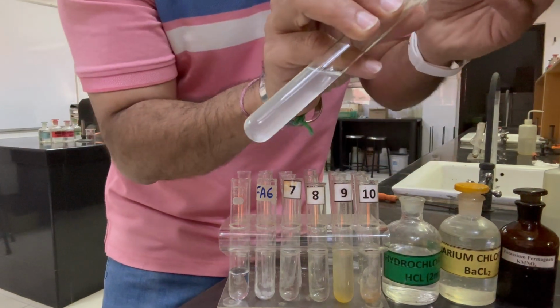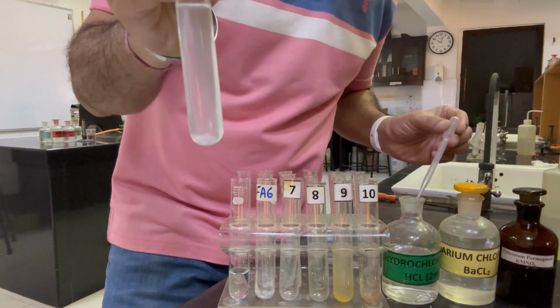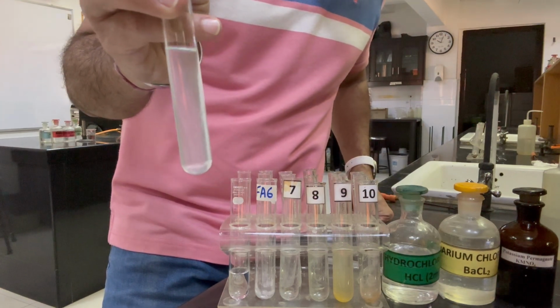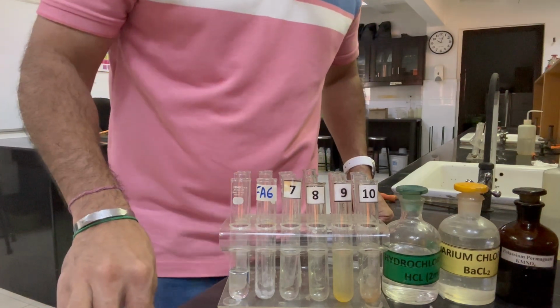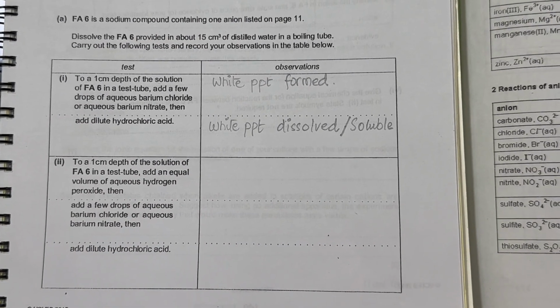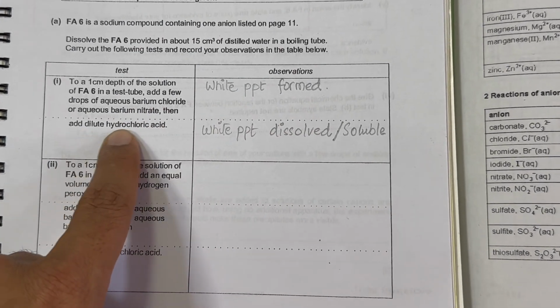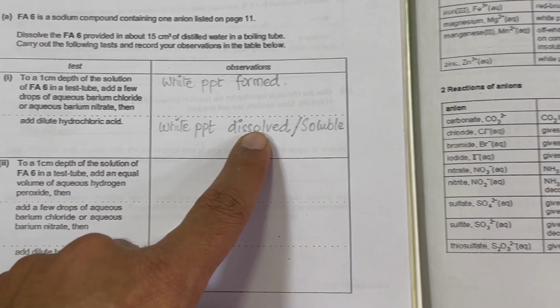It means when barium chloride is added, precipitates are formed. It means sulfate or sulfite is present, and if we add acid and those precipitates dissolve, it means sulfite is confirmed. So we will record this observation. When we have added barium chloride, white precipitates formed, and when we added hydrochloric acid, the white precipitate dissolved.